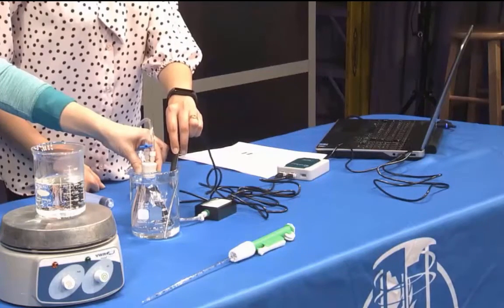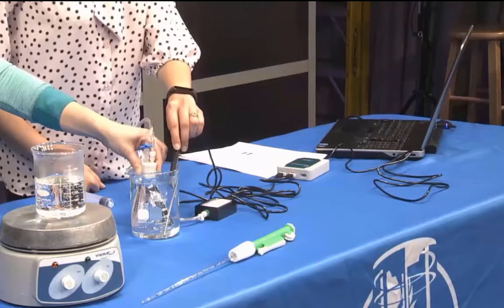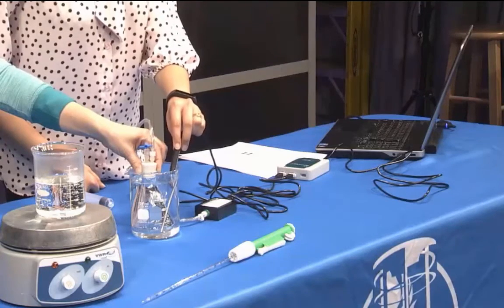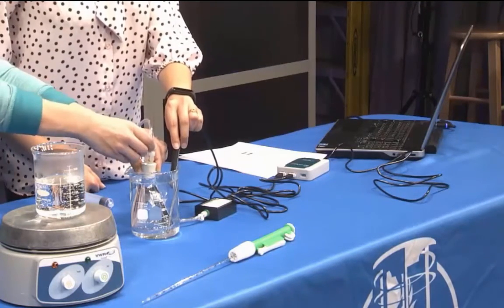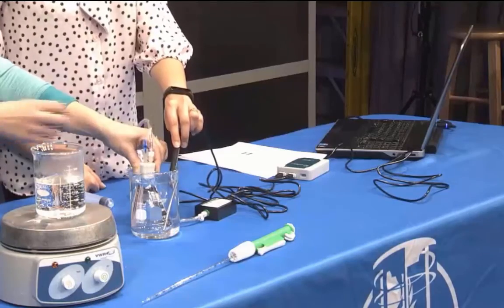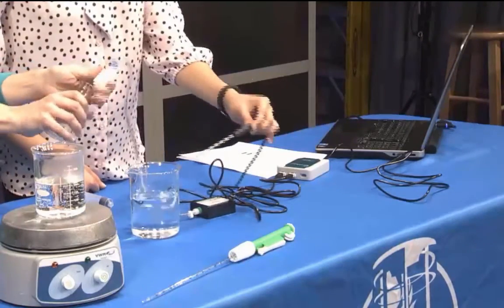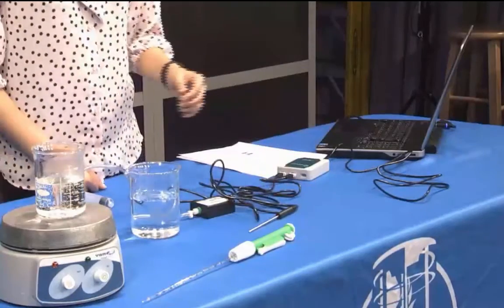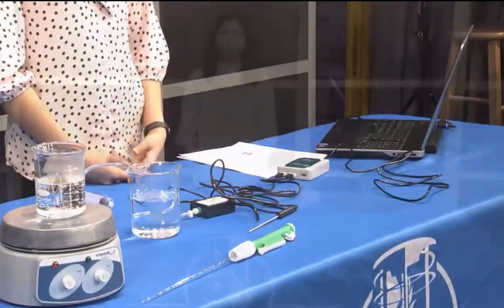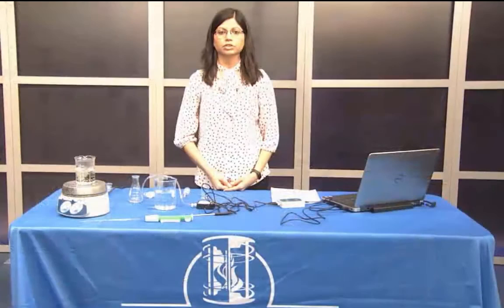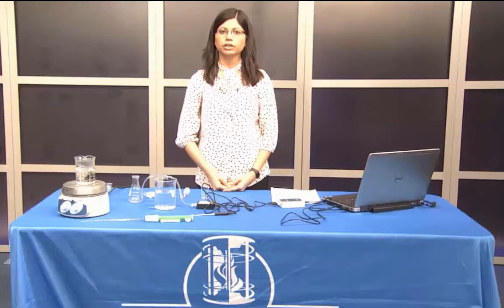After you have recorded the fifth set of readings, open the valve to release the pressure in the flask. Remove the flask from the water bath and take the stopper off the flask, and then dispose of the ethanol as directed. This is the complete procedure for completing the vapor pressure and heat of vaporization lab. Be sure to read your lab worksheet for some additional details.